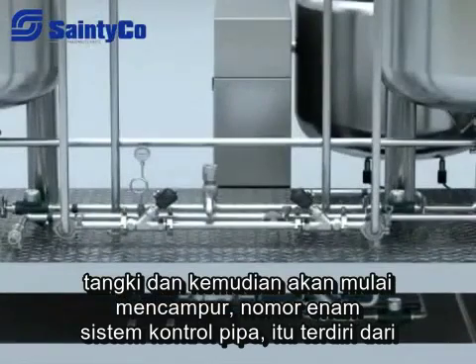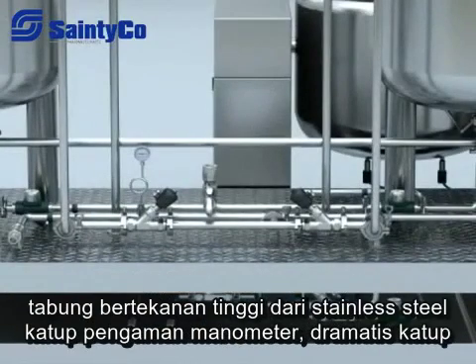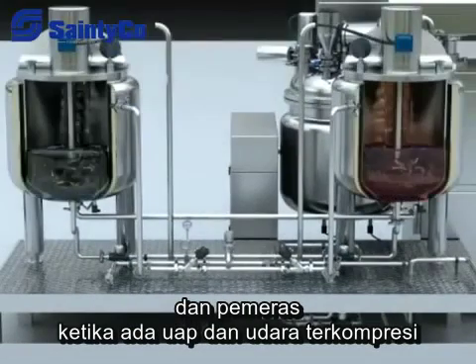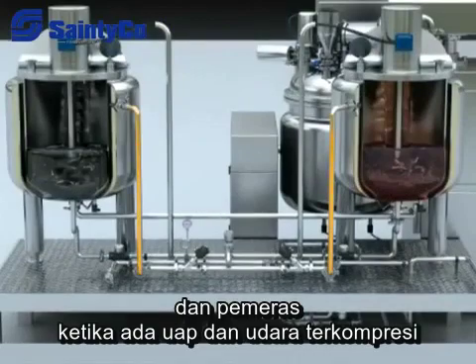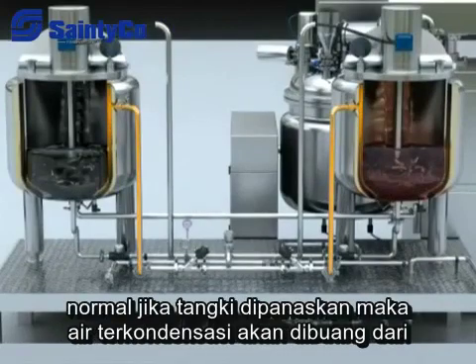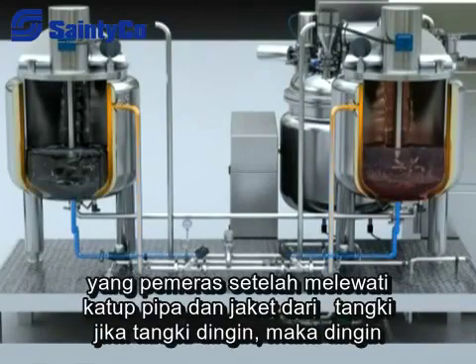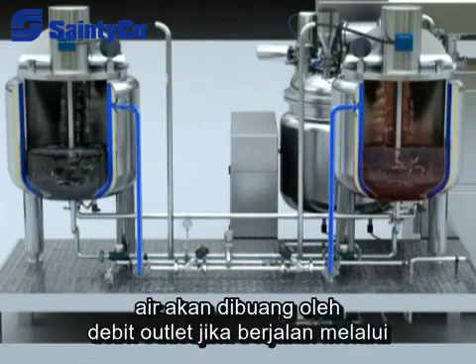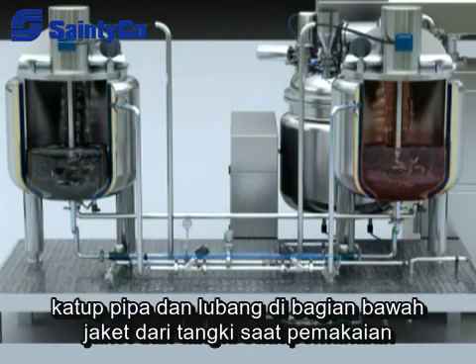The pipeline control system is made up of high-pressure stainless steel tube, safety valve, manometer, pneumatic valve, and bleeder. When the steam and compressed air are normal and the tank is being heated, the condensed water will be discharged from the bleeder after passing through the pipeline, valves, and jackets of the tank. If the tank is being cooled, the cooled water will be discharged through the discharge outlet after passing through the pipeline, valves, and lower hole of the jacket of the tank.